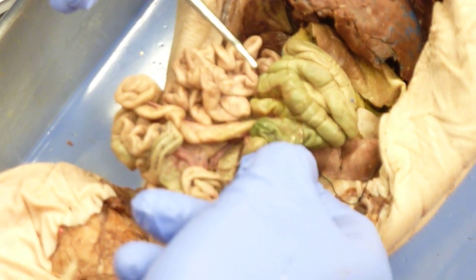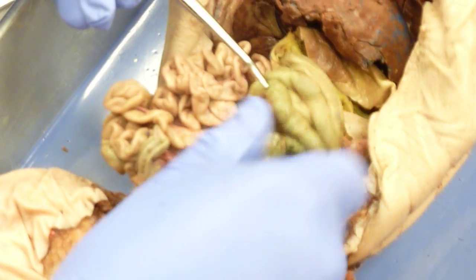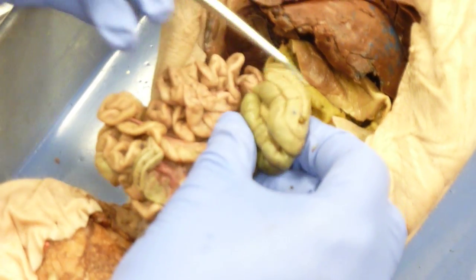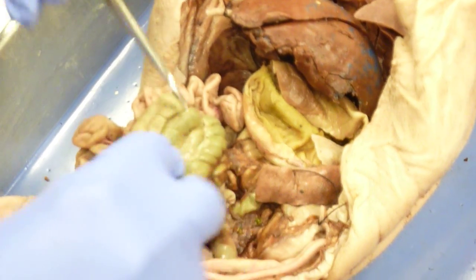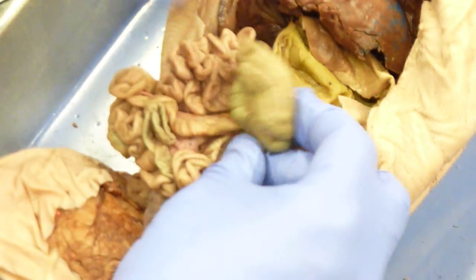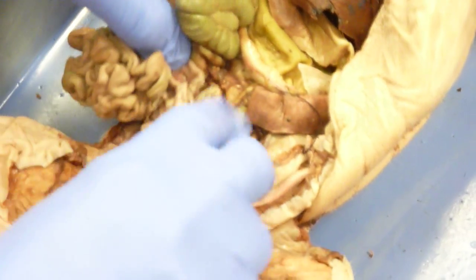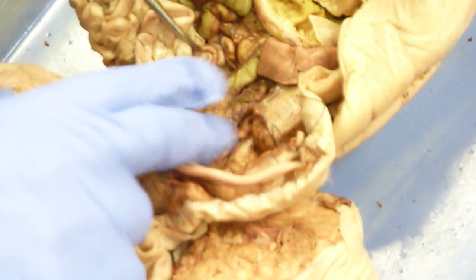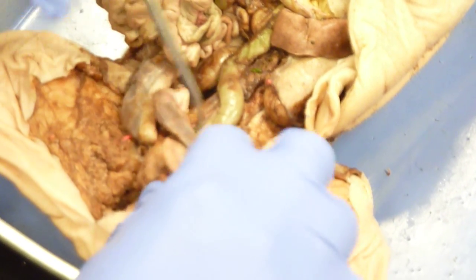The pig doesn't have an appendix — that's in us. Then you've got the spiral colon. And then once you follow the spiral, they don't have the ascending, transverse, descending — it's just a spiral colon. And then when you follow it out and it ends, here's the rectum. And then once you follow it down, you've got the anus.